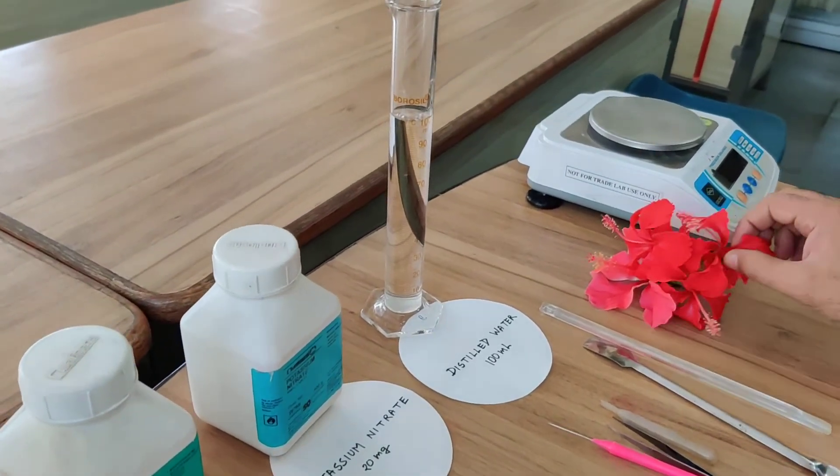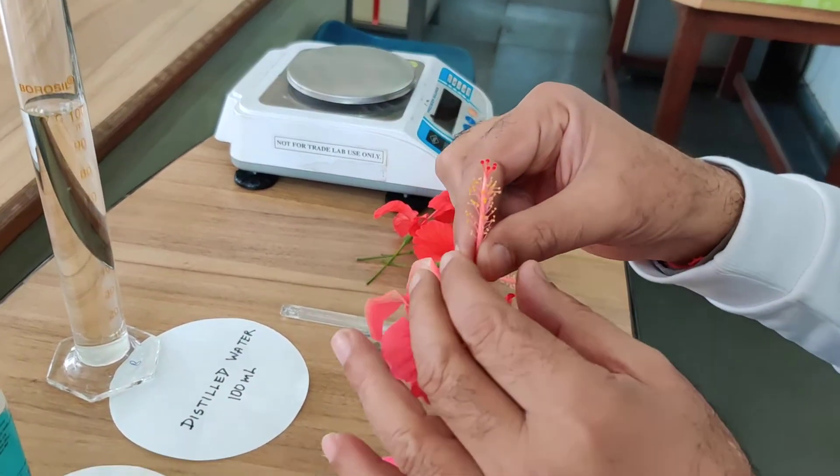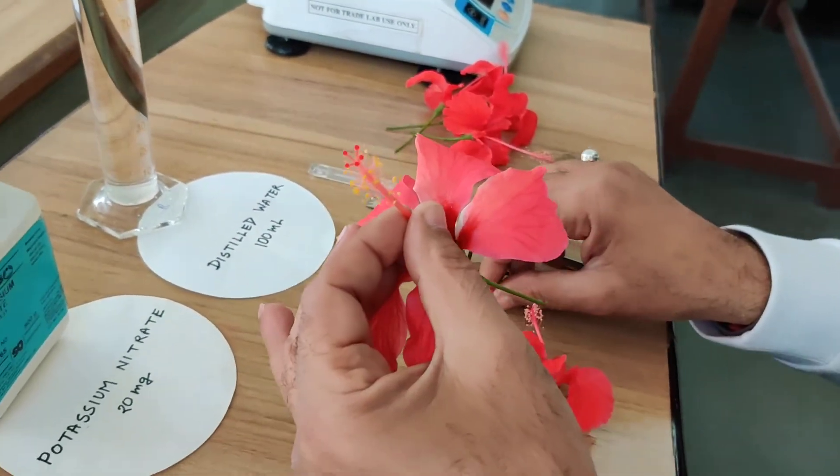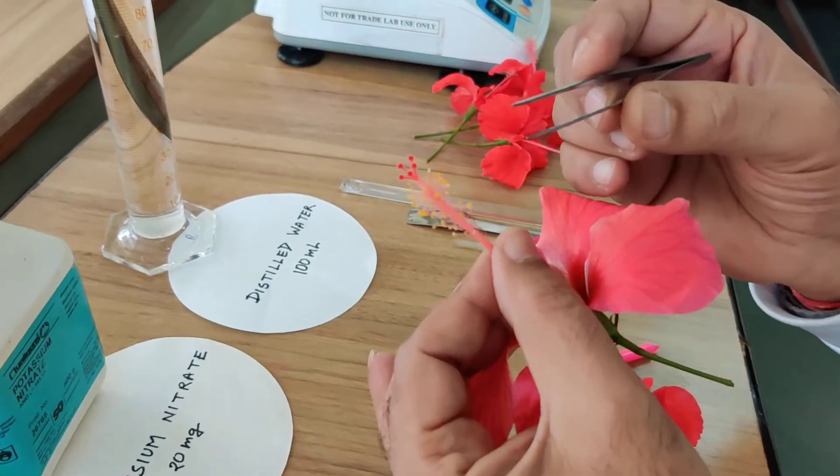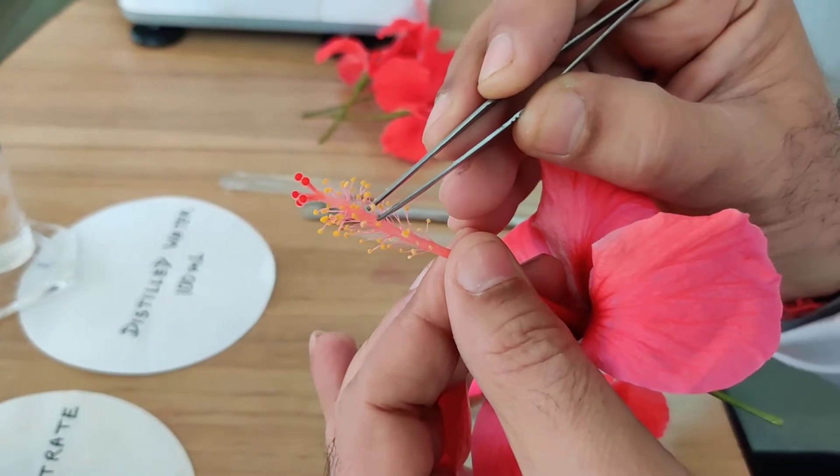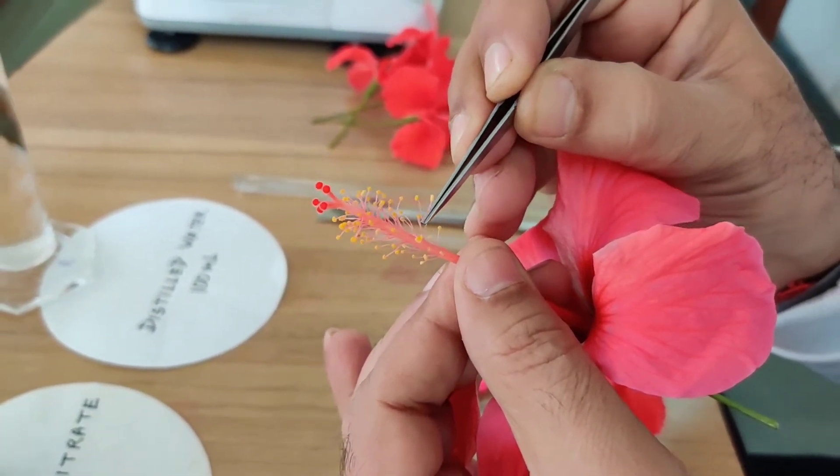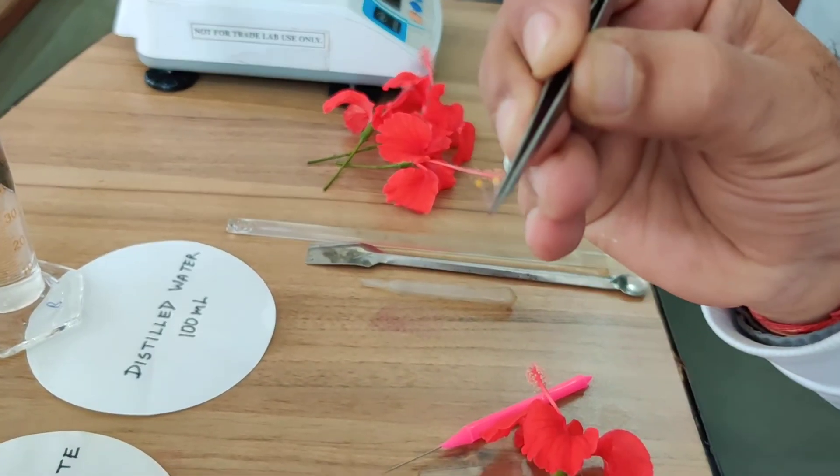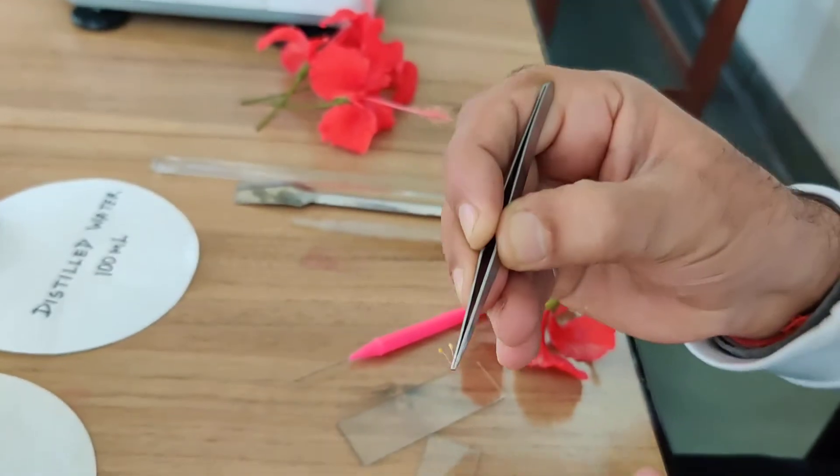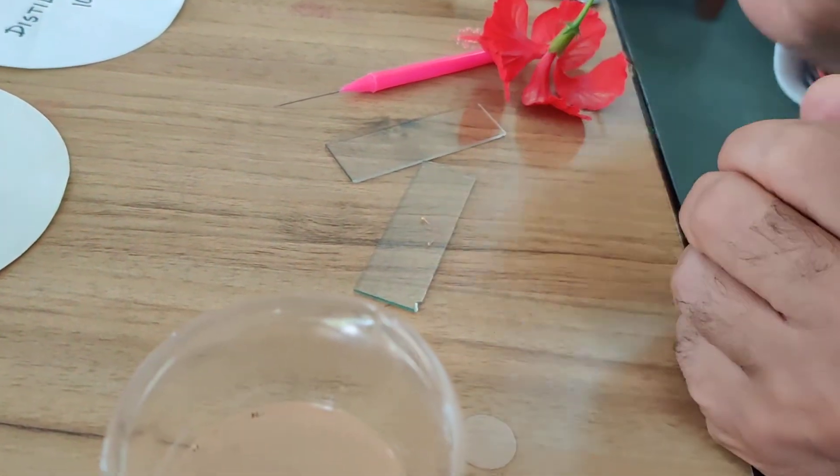Now I am taking a mature flower and from this mature flower I am taking a mature anther, where pollen grains are totally developed. It is a dehisced anther and I am just putting it here on a slide.